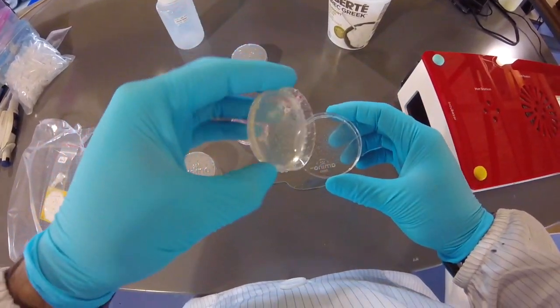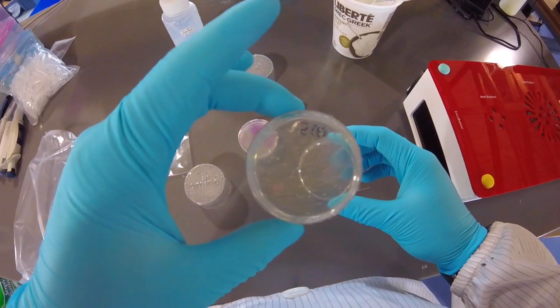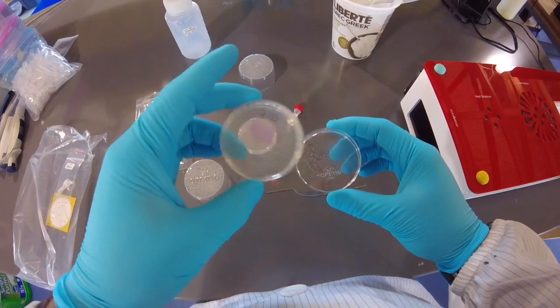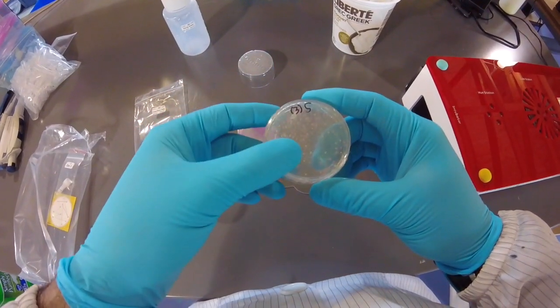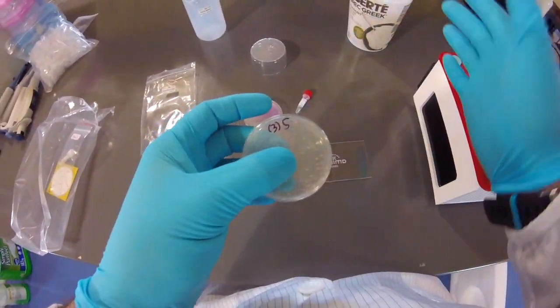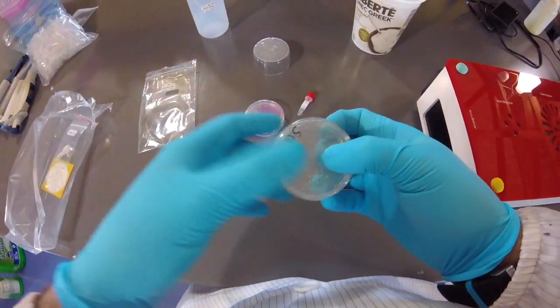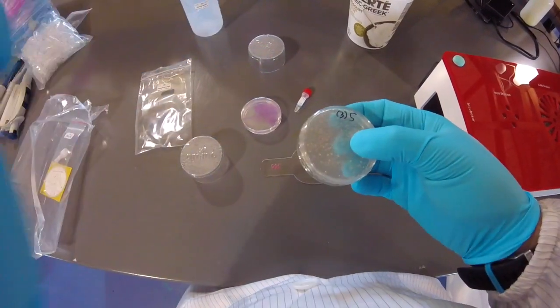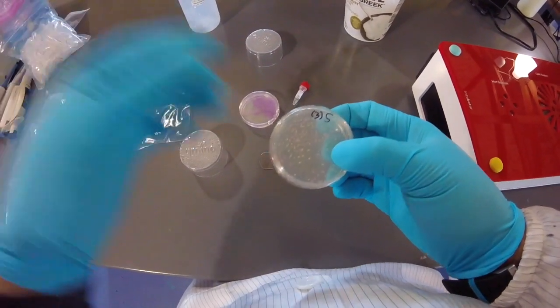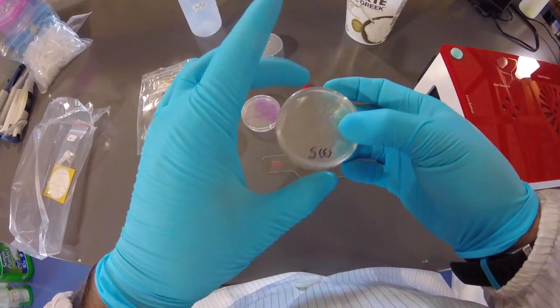So this is a Petri dish. You can see there are quite a few colonies on there. So this is a good result. Getting a single colony of engineered bacteria is actually a great thing. If you got 1 colony, that's a start. I've been doing this for years and years, so that definitely helps me get this result. But if you start with 1 colony, then the next time you do it, you're going to get maybe 10 or more colonies, and more beyond that. So if you got a single colony, congratulations.